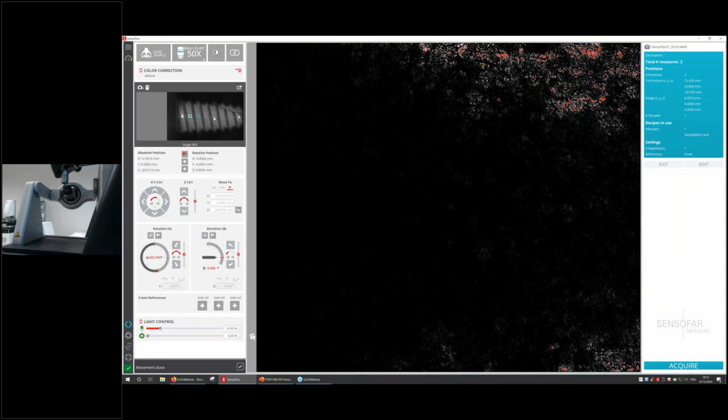You can see these stripes there. And these two blue or greenish areas are the areas of interest in which I'm gonna be measuring roughness. So these areas correspond to the valleys. So first I'm gonna take a topography there, and then automatically the system will go to the right, to the next valley, and we'll get the results.